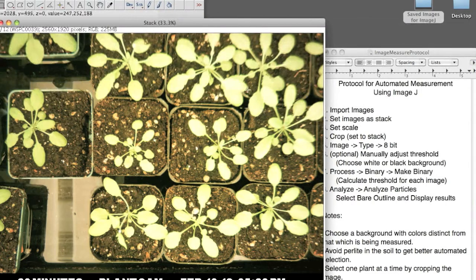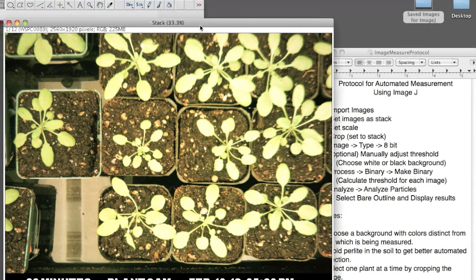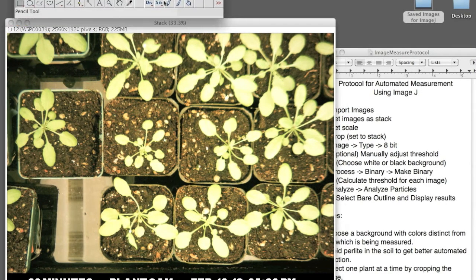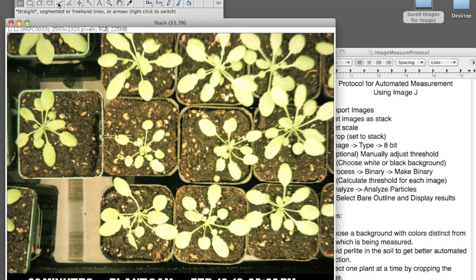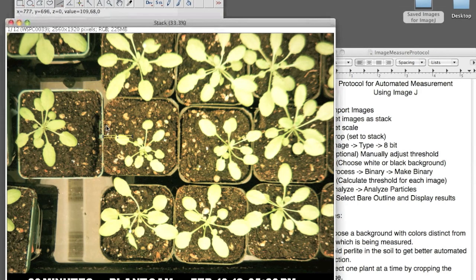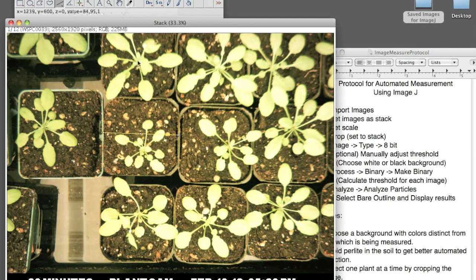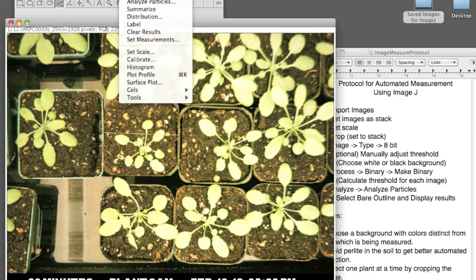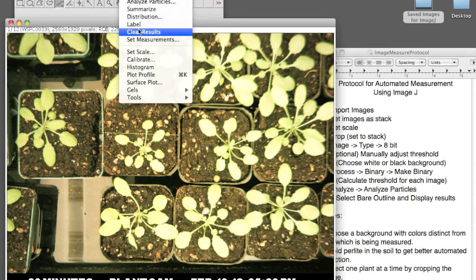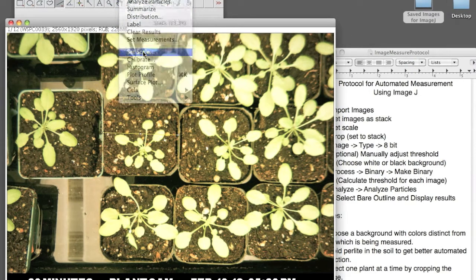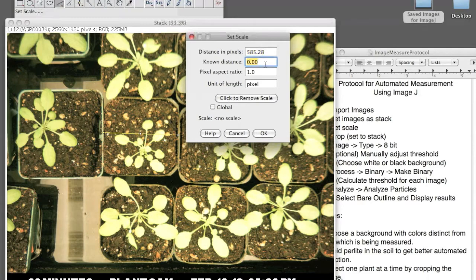Next, you want to set the scale, and you do this by selecting the Line tool. Now, I know these pots are 2 inches wide, and in your image, you want to have something that you know the length of. And then you go to Analyze, Set Scale, and this line is 2 inches.